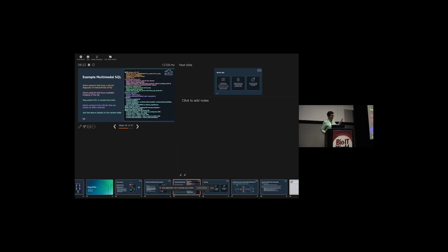The last piece to this is basically the connectors that glue these things together. So in this example, the VCFs don't have the patient IDs. They have a different barcode associated with the samples. And so we have another table that maps between the patient ID and the sample barcode, which allows the connection to the genomic data. So again, this is a big chunk, but hopefully what you can see is that there's individual computed tables that then get made available to this final join.